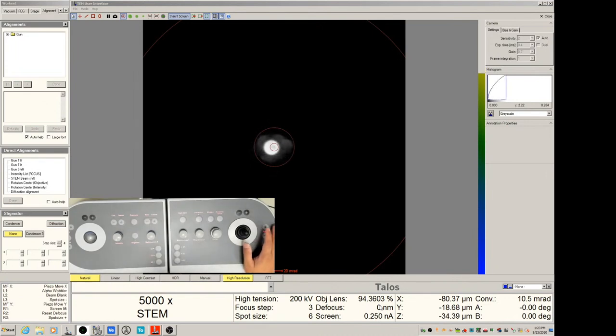So you see the Ronchigram changed, and right now we are really seeing the Ronchigram, really nothing showing up in the center. And if we keep going, we now start to see the image again, like the small particles inside. So I'm going back. Like here, we see the flat area, so that's going to be our eucentric height. So this is method one, and it requires some knowledge of STEM operations on the 2100 and 3100, and an understanding of the Ronchigram.